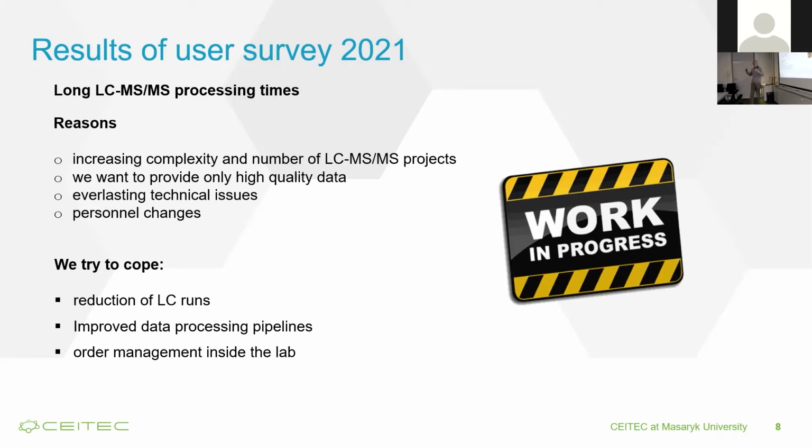if you think that at the moment we reduced queues on instruments to 2-3 weeks, and even if we allocate instrument time for you in advance, this experiment might be postponed due to some technical issues. So even this technical part takes several weeks. And then we also have to validate and process data properly to give you a really high quality result, which is our aim.